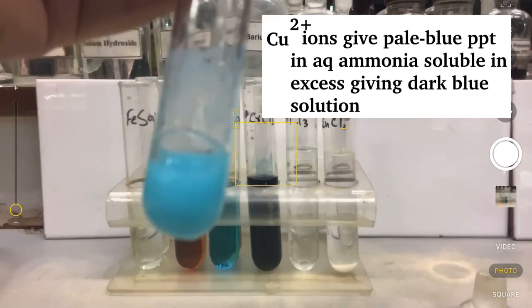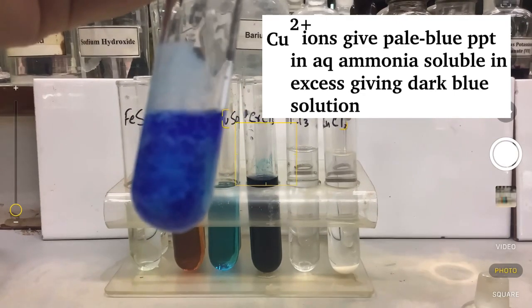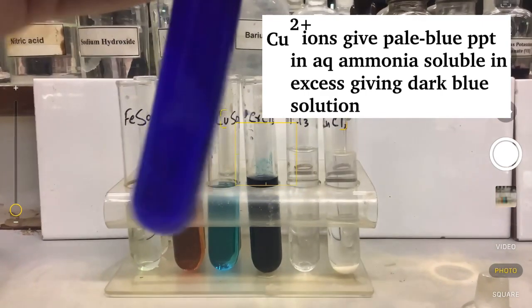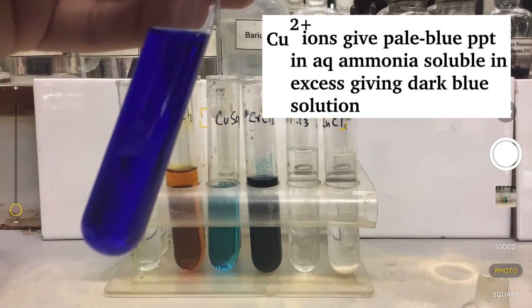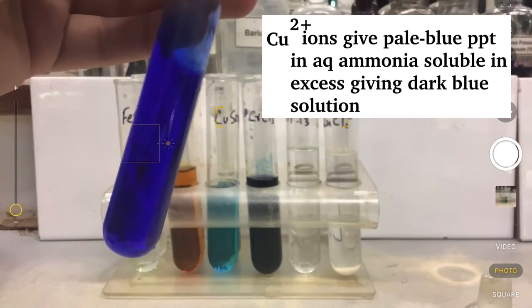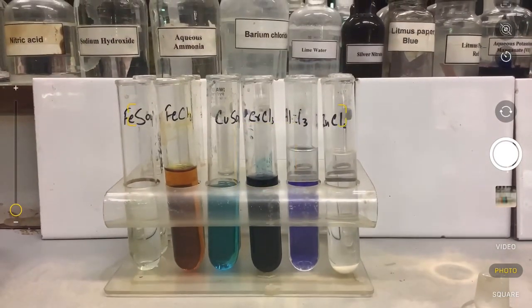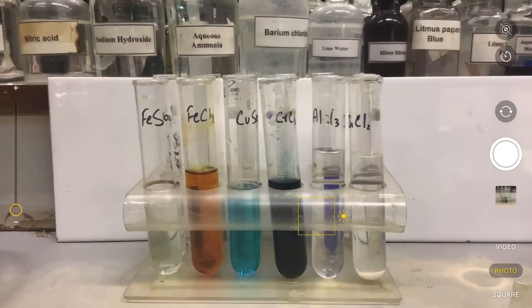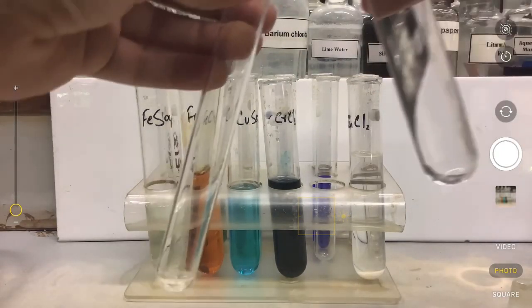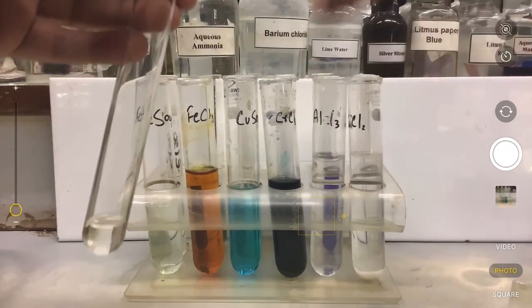Now what happens if I add excess? Because it says soluble in excess giving dark blue solution. You can see that I add excess aqueous ammonia, I can clearly see precipitates have dissolved and a dark blue solution is made. This is another characteristic feature of copper 2 ions testing. Now since we are done with the colored solutions, let's go for the colorless ones, aluminium and zinc notably.